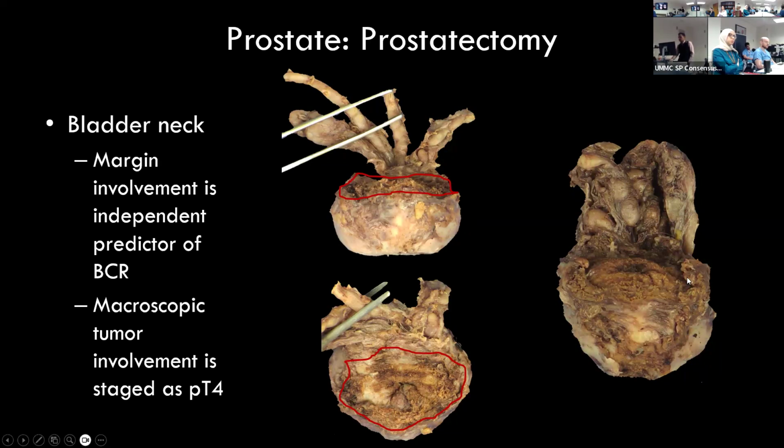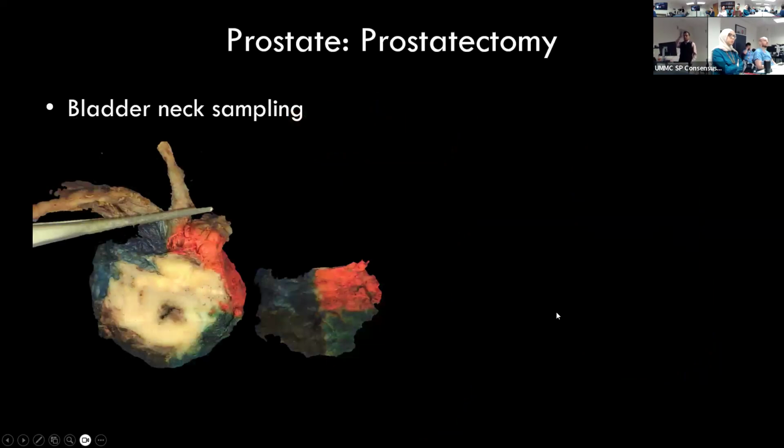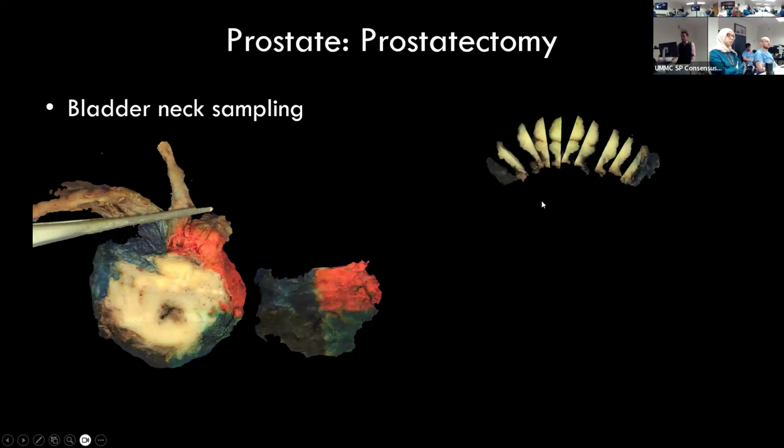So take a nice generous section all through here, and then you're going to do perpendicular cuts like that, right? So this is what you see. You take a nice thick section over there, and then make perpendicular cuts and lay it down on an edge.